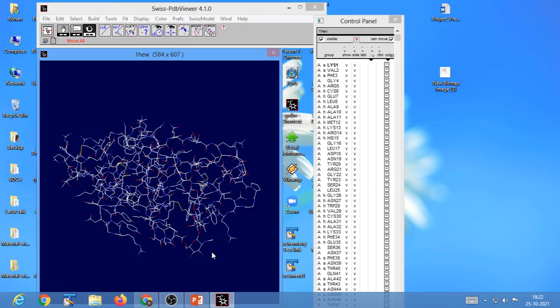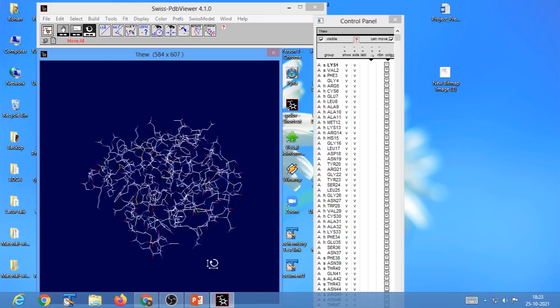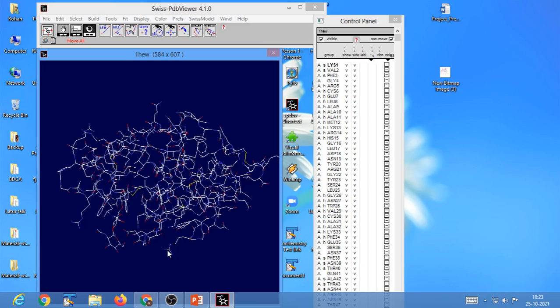Because colors can reveal structural, chemical, and comparative features very vividly, by coloring your model properly, it can help you to keep your bearings during complex operations. You can keep tabs on what is happening where, when you try to compare proteins, or when complex operations need to be done. So in that context, coloring can be very useful.